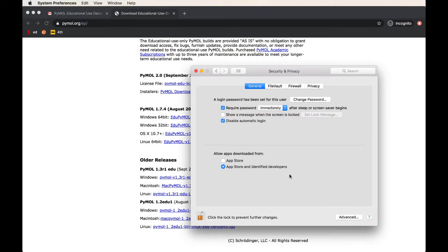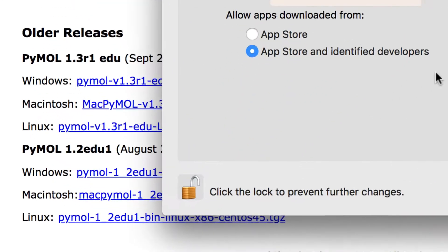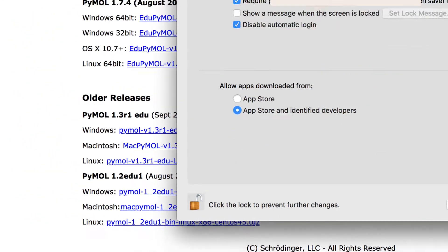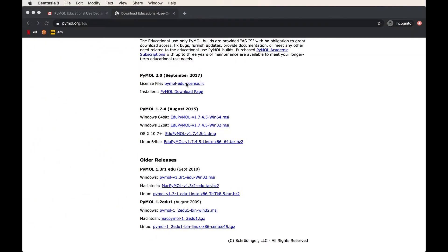So you're going to have to enter your computer's username and password in order to get this done. If you have a computer from a university or a school, you may have to get permission from the institution to do this. But if you have your home laptop, this should work just fine. Once you've entered that information, you'll notice that your icon is unlocked. Now you are able to download software from the web.